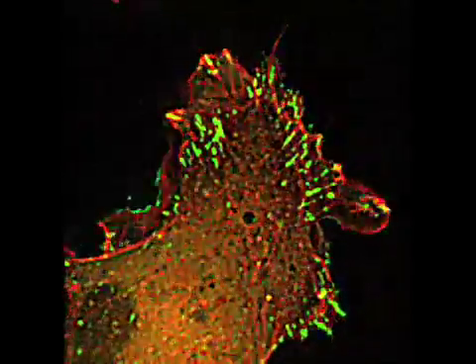This is a fibroblastic cell. We've engineered these cells to express a green fluorescent protein MENA, so it shows up in green, as well as red actin.